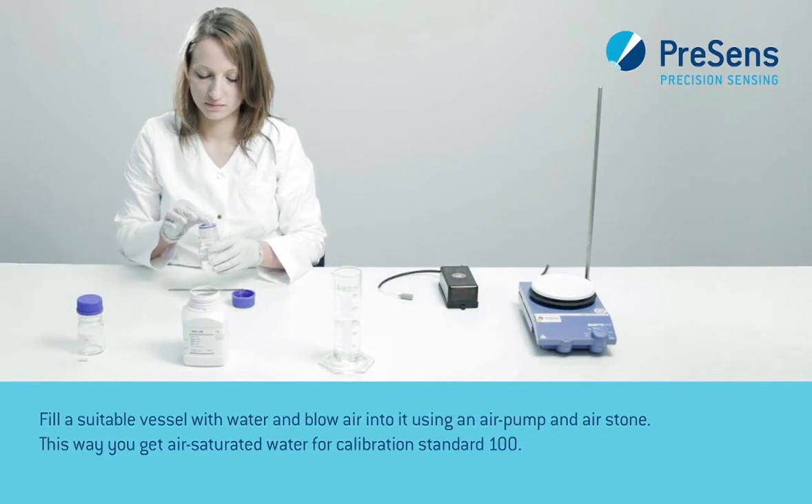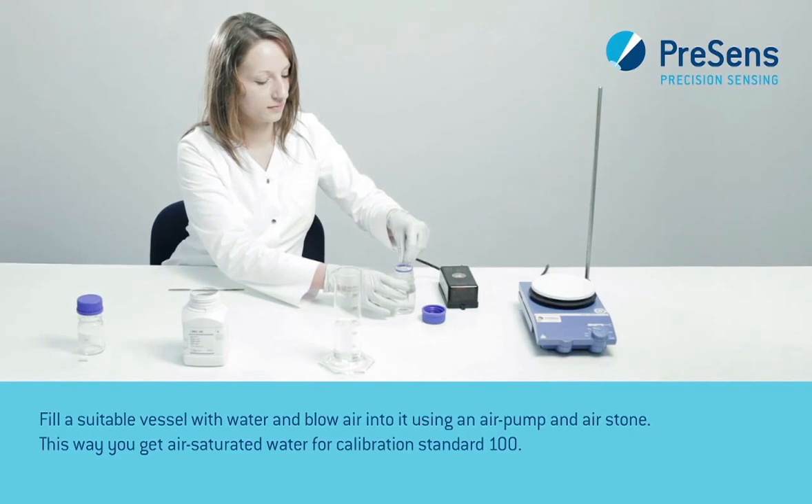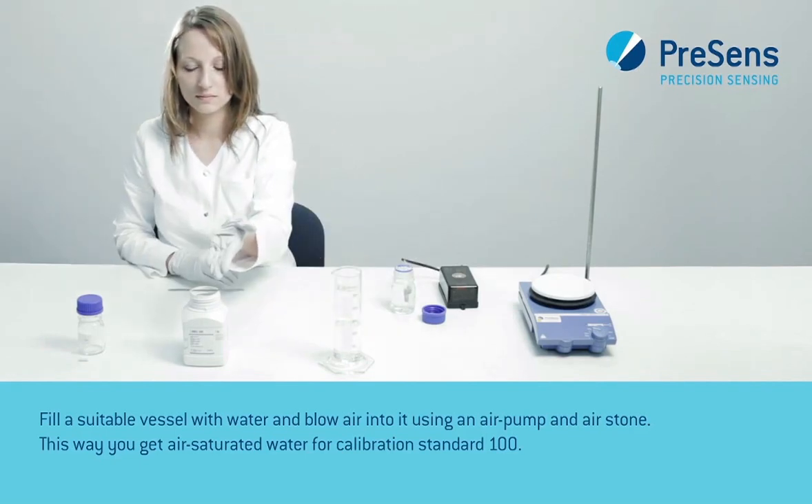Fill a suitable vessel with water and blow air into it using an air pump and air stone. This way you get air-saturated water for calibration standard 100.